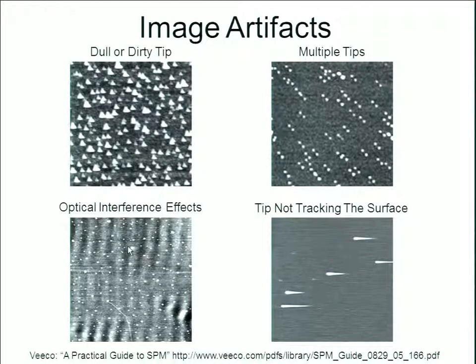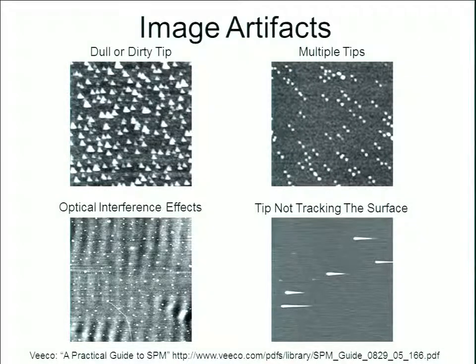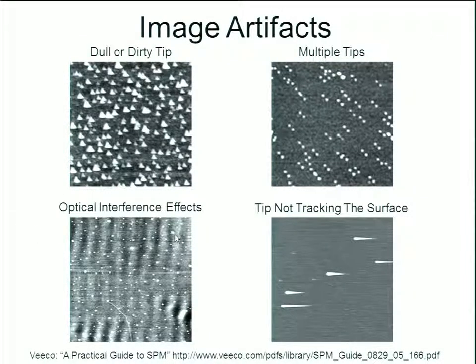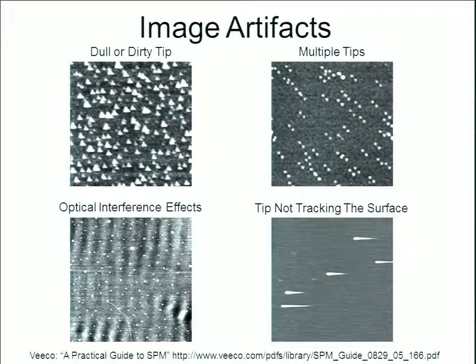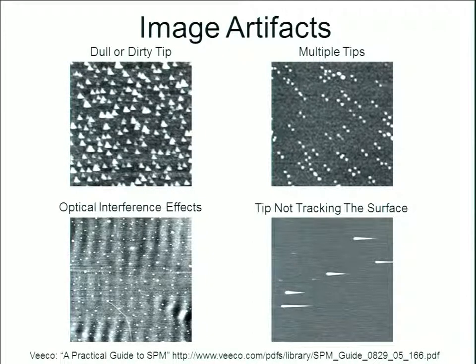Another common artifact is optical interference, which occurs if part of your laser beam spills over the cantilever and is reflected back to the detector. What you end up picking up is the optical interference pattern from the laser light itself, appearing as a series of waves throughout your image. Another artifact is the tip not tracking, also called parachuting, which occurs if your feedback loop is not set up appropriately. It's important to learn about the different types of artifacts that may occur, and to learn how to avoid or correct them.